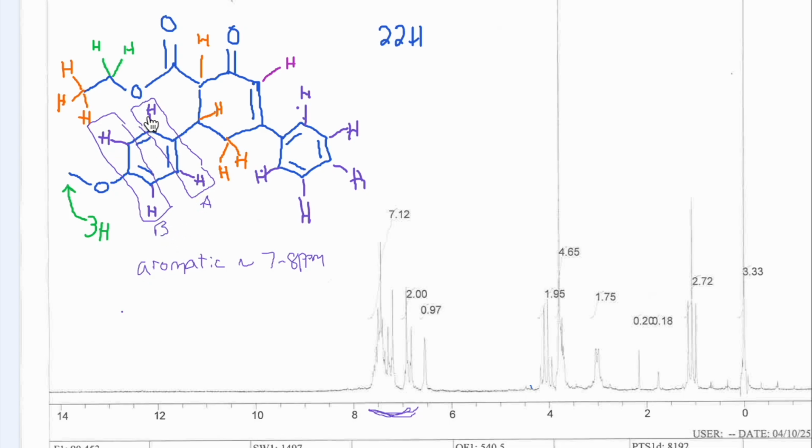But then since we have the same situation on the other side of town, we have two copies. And so the doublet for A integrates for two protons because we see it twice, and the doublet for B integrates for two protons because we see that twice. This particular doublet, we were not able to get out of this mess, so I don't have it called out separately. This one was far enough away that you were able to see. So you can see the two doublets being worth different, two each.